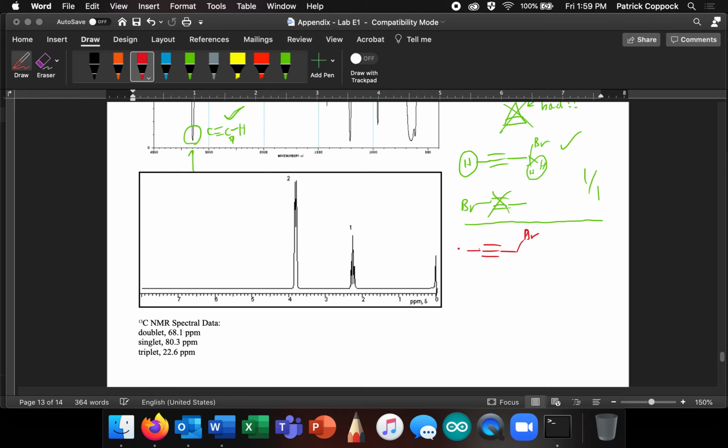Okay, I'm going to assume this is the structure. I'm going to call this atom hydrogen A, and these 2 hydrogen B. Okay, so type, number, n plus 1, and shift. This really helps, right, to make predictions in advance, A and B. How many are A? There's only one that's A. Likely that one, right? 0 neighbors, so it should be a singlet.